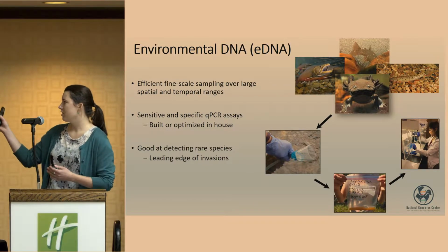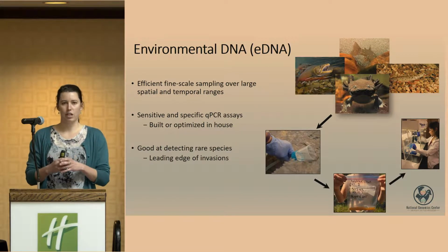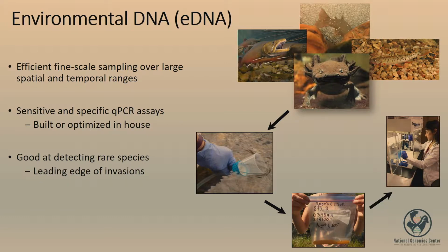We have pictured here kind of the process. The plastic cup there in the water has a filter in it and it's attached to a pump. So as you're pulling water across that filter, any DNA that's in the system from organisms can be potentially collected onto that filter. You would then simply place that filter in some sort of storage material. At the NGC we use desiccant, and you would send that back to a lab for analyses.